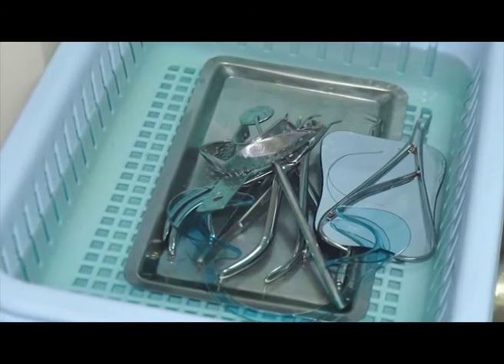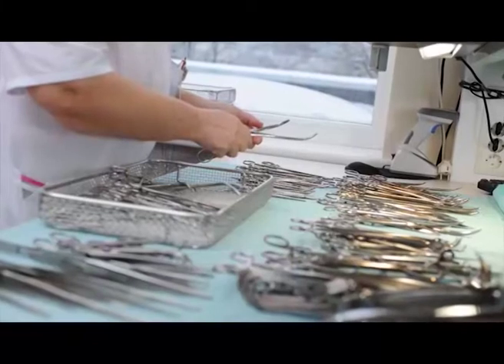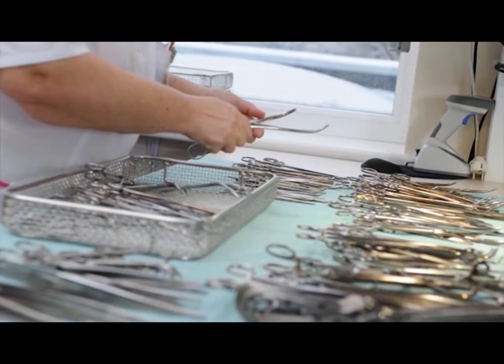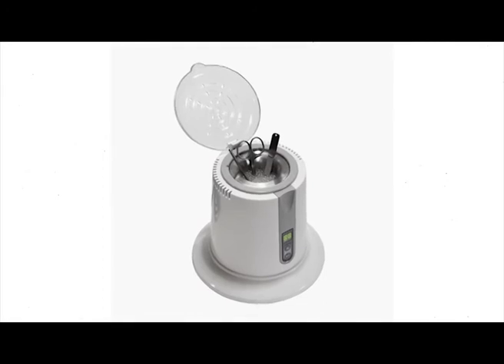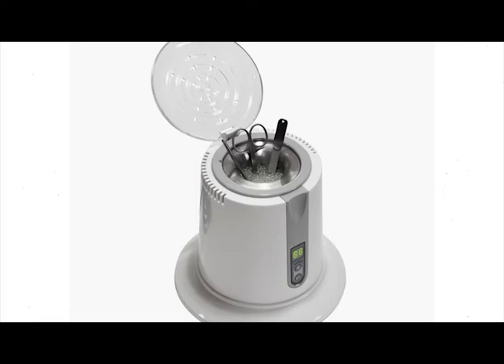Reusing instruments. When surgical procedures are to be performed on multiple rodents, the same set of instruments may be used on more than one animal under the following conditions. The instruments must be initially sterilized by autoclaving or gas sterilization. Instruments should be wiped with alcohol or sterile saline to remove blood and tissue particles between animals. The tips of instruments must be placed in a hot bead sterilizer between animals.